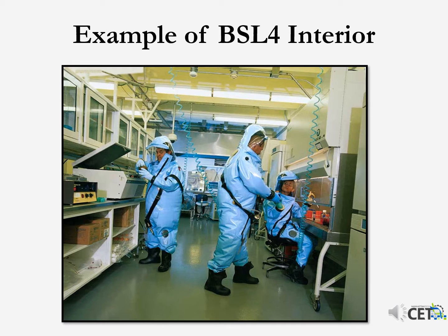So the people working in these labs, you can see in the picture, have many layers of safety protection on. That safety protection is called personal protective equipment, PPE. The air they breathe is, you see the little tubes coming into their outfits? That's air being pumped in from another source outside the room.